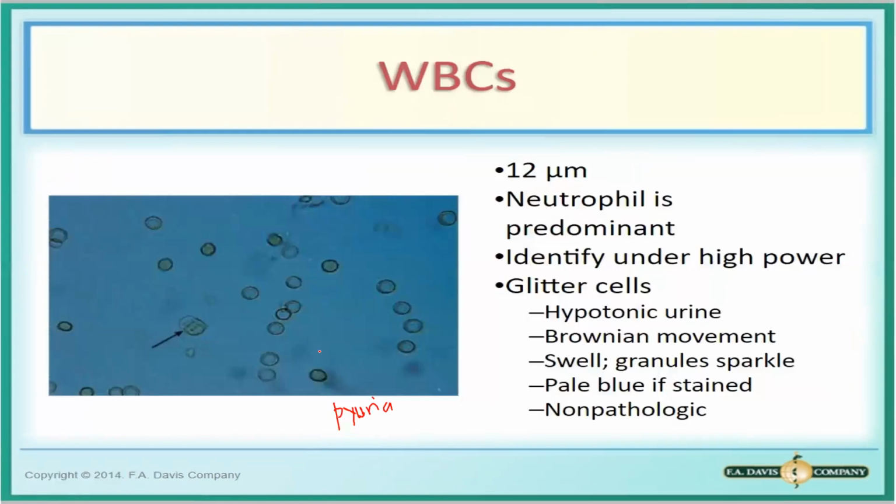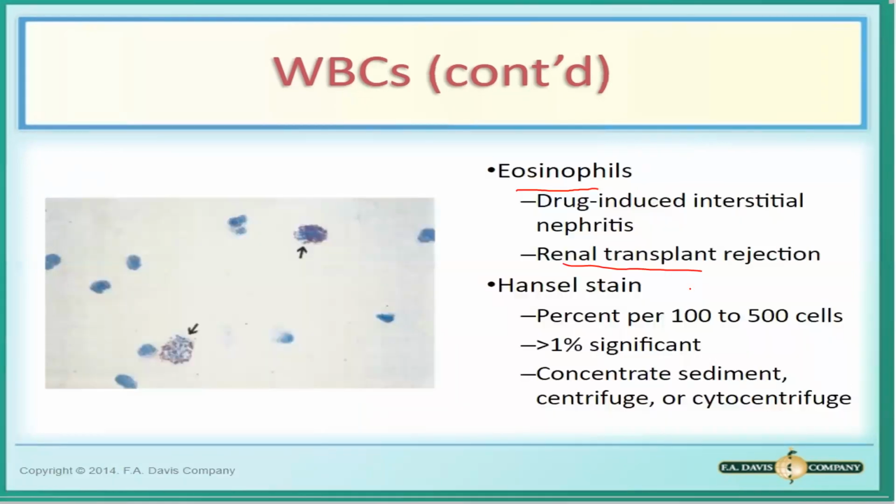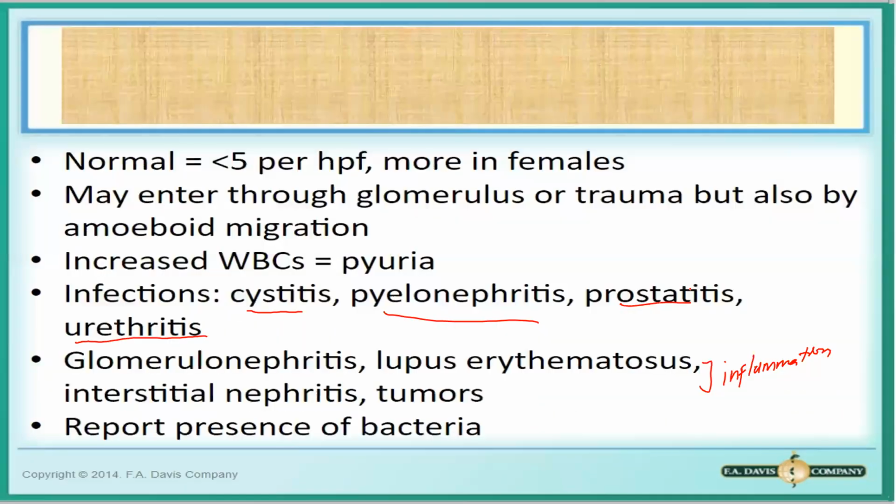Ibalik natin yung picture. So yun ang itsura ni WBCs. You can also see po, depende sa type ng WBC, makikita mo rin yung kanyang nuclear detail. And tignan mo yung kanyang cytoplasm, medyo parang madumi, because it is granulated. Most commonly, di ba, na predominant type of WBC natin is neutrophil. So, ayan ang itsura ng WBC natin.